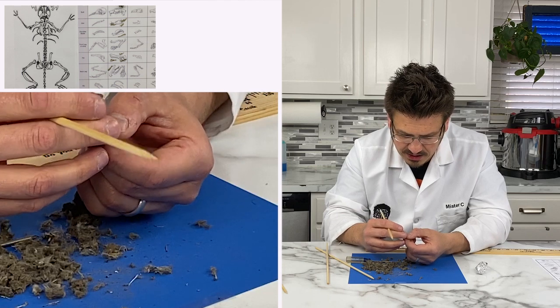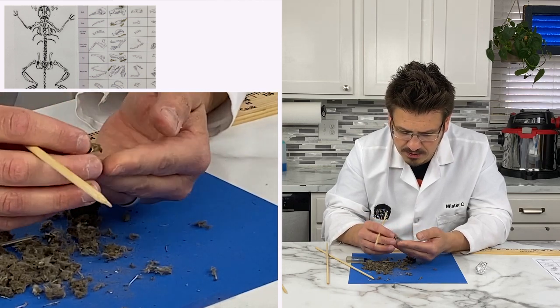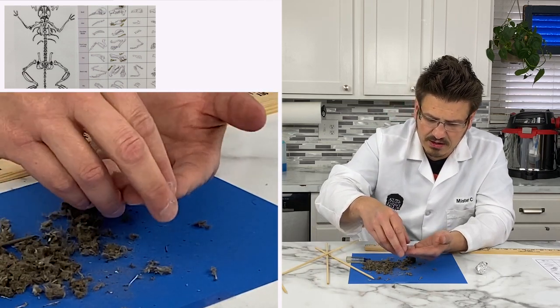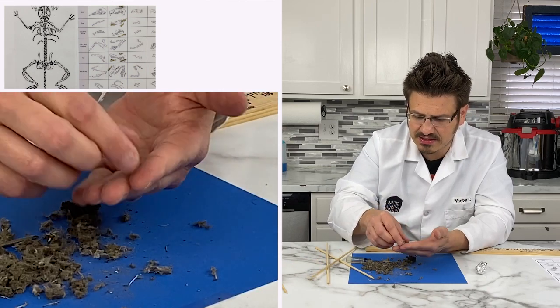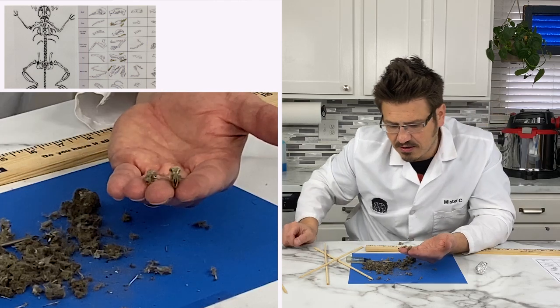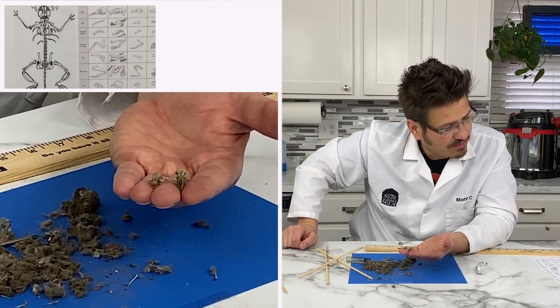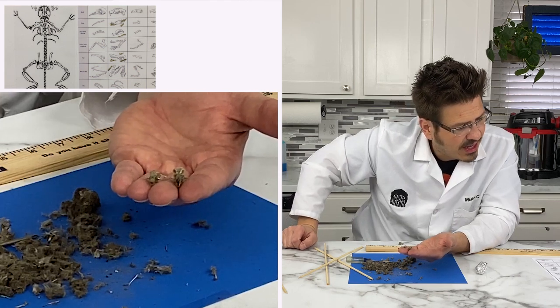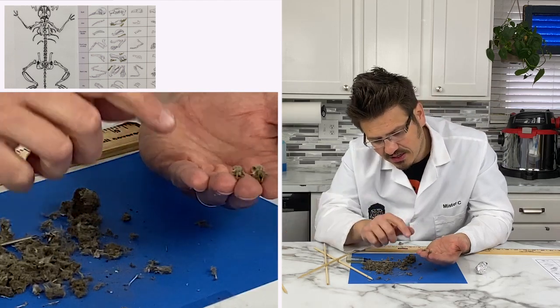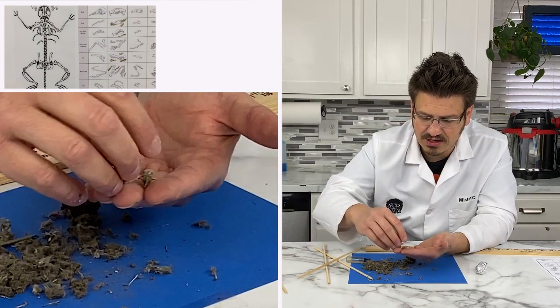All right, so I think that's as clean as I can get it with what I have here. Look at that, though. I'm going to bring the other one back over. That's a decent size skull. And then here's the other one. Teeny tiny little rodents. I think they're both mice too. I'm pretty sure. Yeah, the shrew and the mole don't look like they have these eye sockets right here. But look at that. Those are the heads.